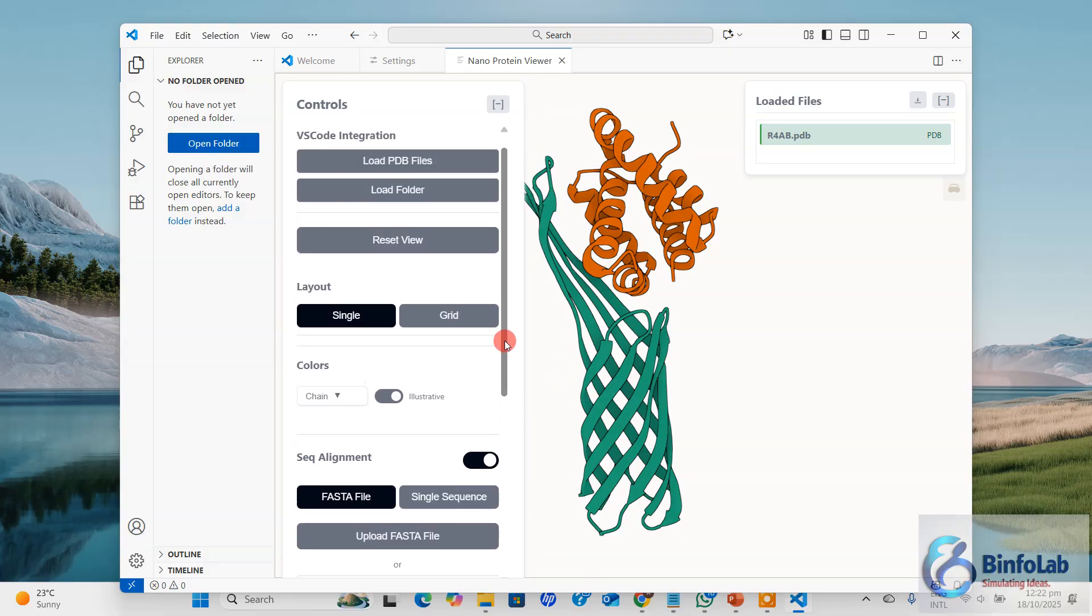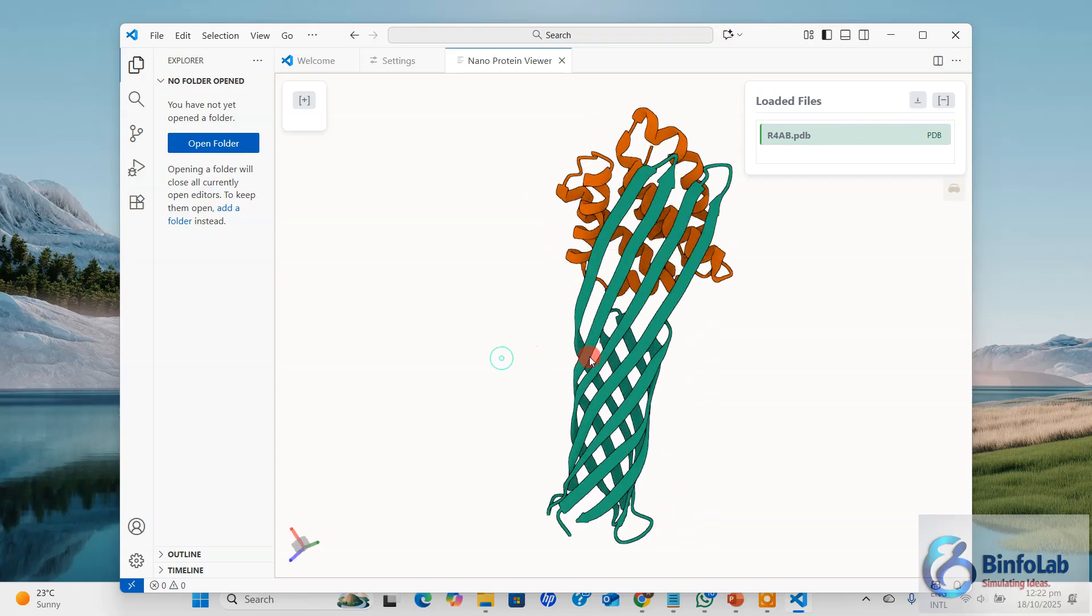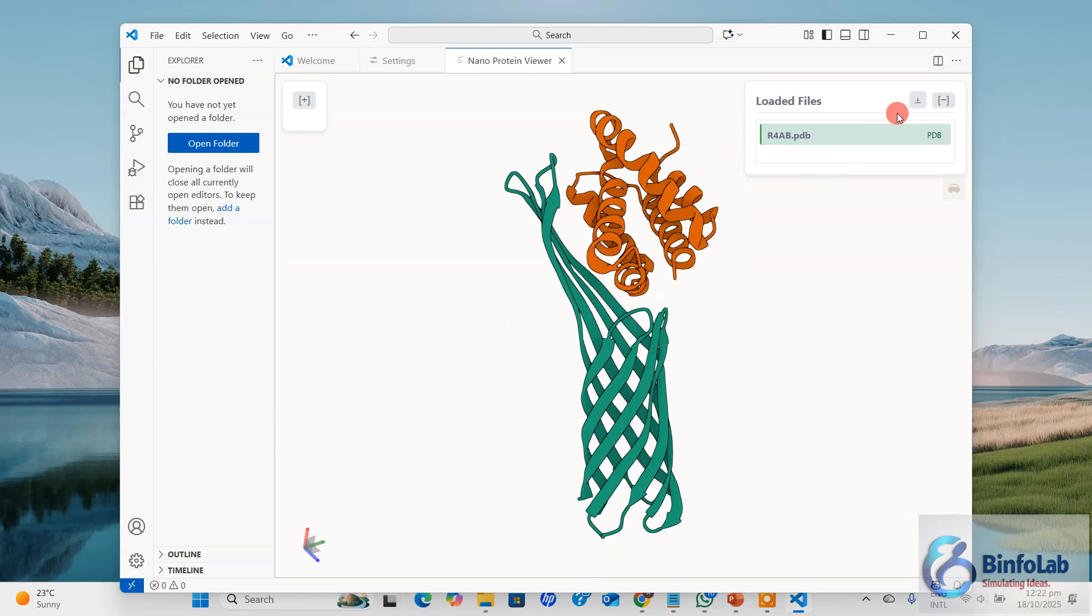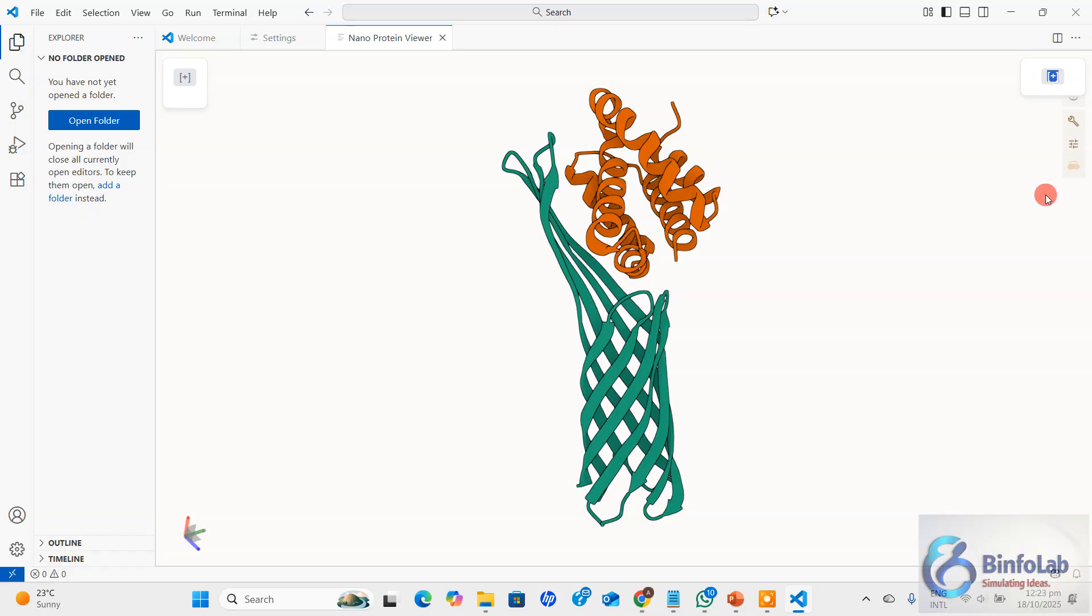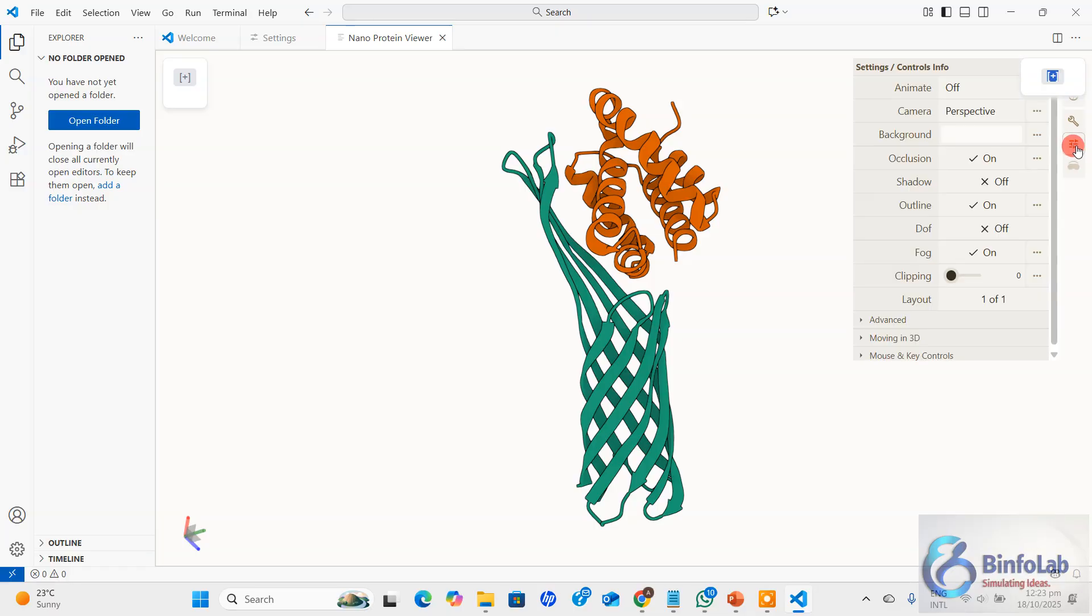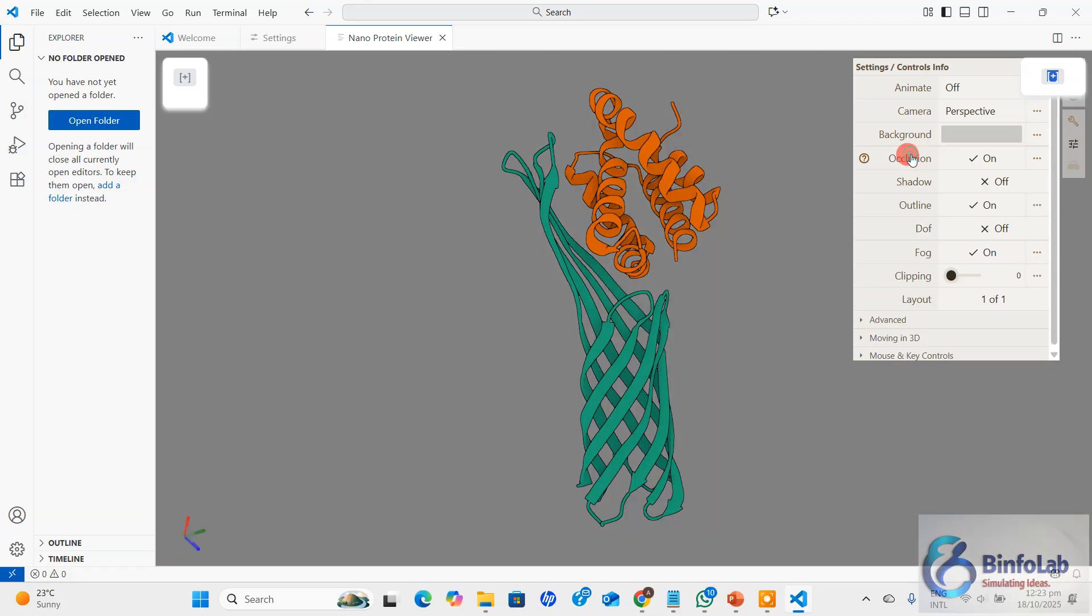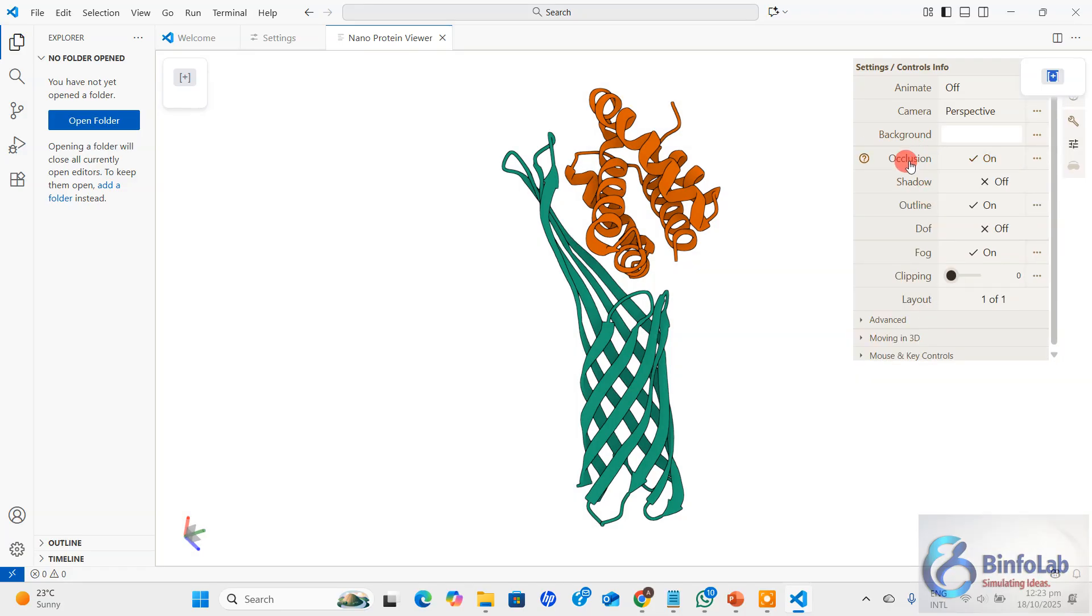Your structure is loaded. You can minimize this window like this. Once you minimize this window, you will see four options here. One is for augmented or virtual reality - my computer doesn't have support, that's why this is turned off. Three more options: this one is for taking snapshots, this one is for some settings, and this one is for managing settings.